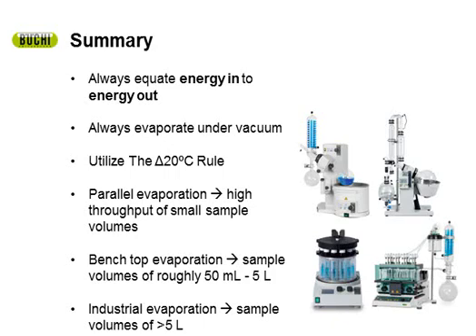Now, if you're talking about a benchtop rotary evaporator, we have glassware known as a beaker flask, where the flange is removable, and it's a big beaker, and you can put your hand right in and get it out more easily.